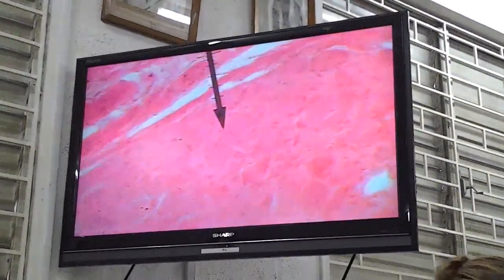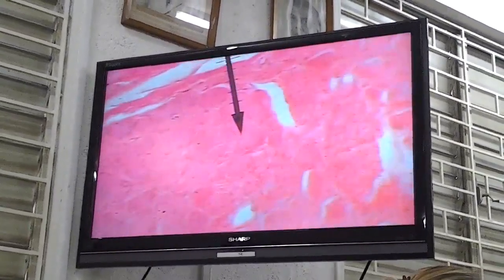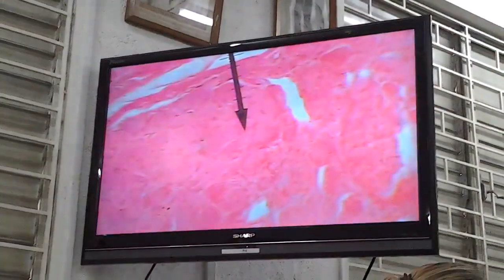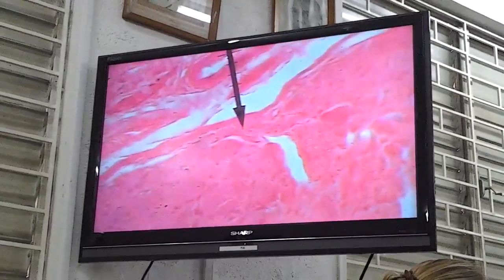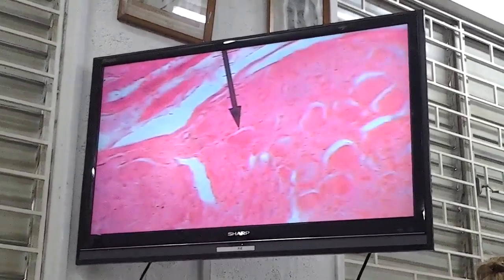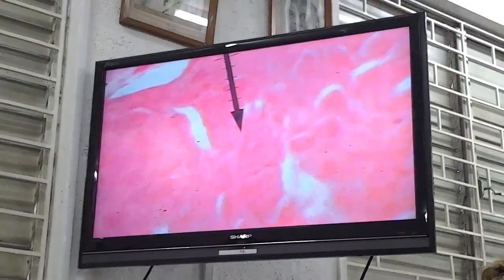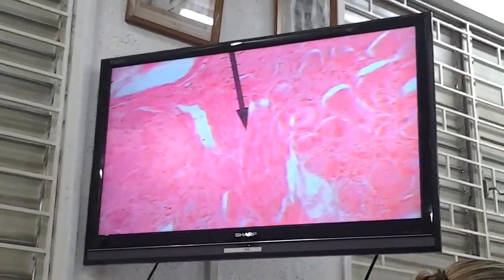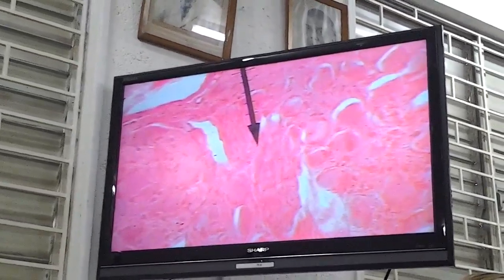So just take a good look at this. Okay. Alright, so we're looking here at the ganglion. Okay. You can see this encapsulated right here. It's a capsule surrounding the ganglion right here. And this is where lots of nerves are entering in. Okay. So these could be just the input of the pre or post ganglionic fibers right here.